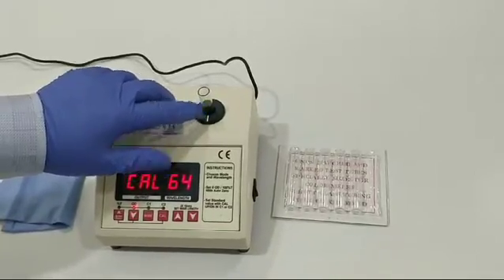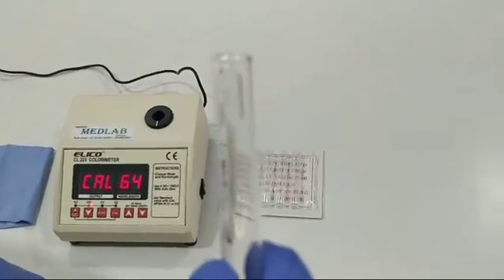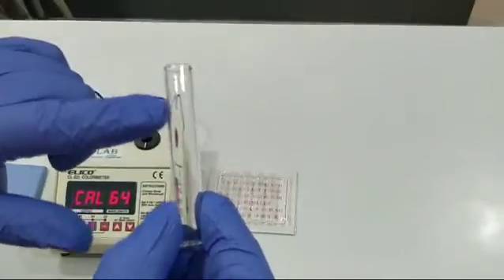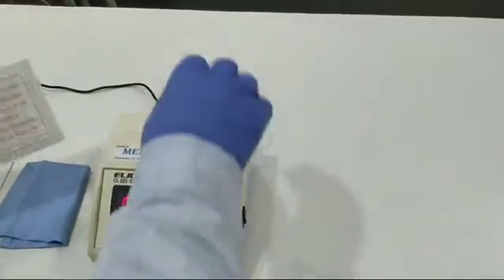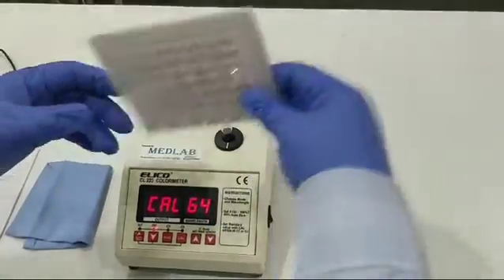After some time, the markings fade away. As you can see here, there is a marking on the glass, and this marking will fade away after some time. There is no stand included to place the slides or test tubes. You have to buy your own test tube stand to place the test tubes.